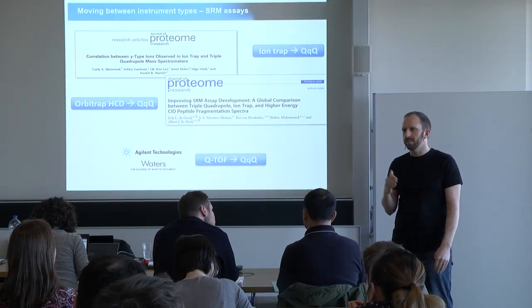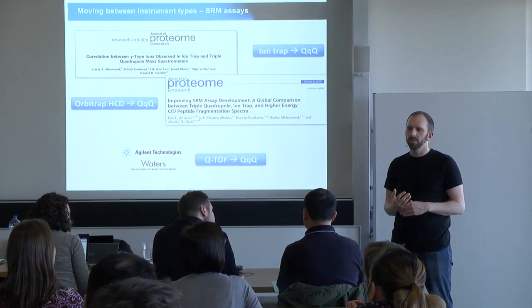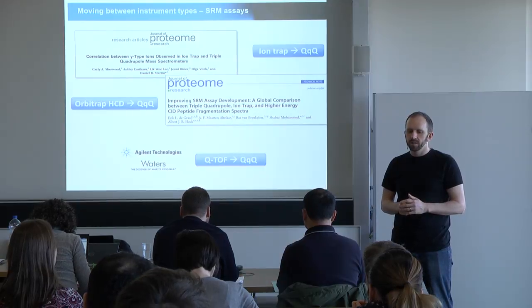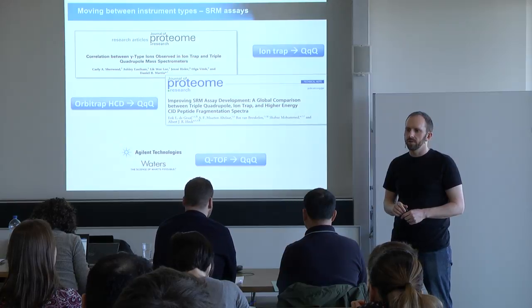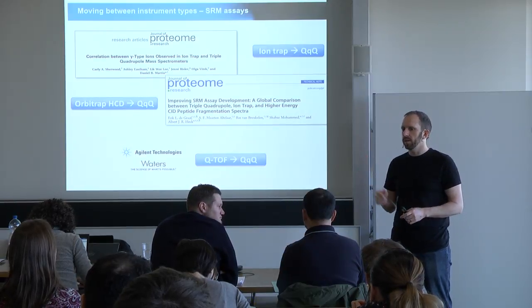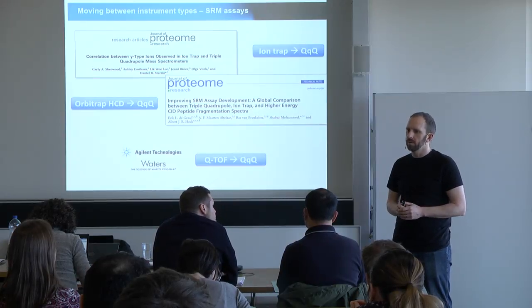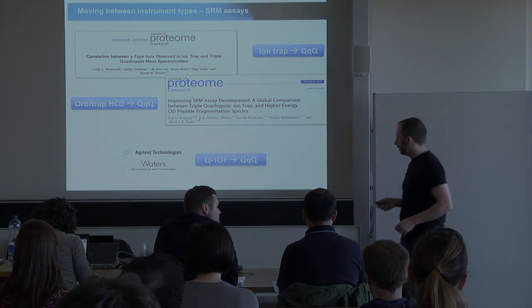But then there are other statistical considerations. If you make the library very large, then the statistics get a bit more difficult, and I think Yancheng will also mention something about this. But already doing replicate injections of your samples in DDA mode, up to 10 times or so, I think is a very reasonable place to start, and then you can think later about pushing it further. Okay, I'm sorry if I went over time.